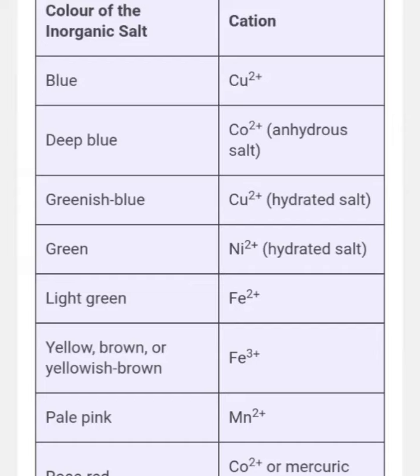All right, these are some inorganic salts that you should take note of their colors. They're sometimes very important in practical chemistry when you are doing your confirmation. These are the preliminary analysis you have to do to identify the color of different salts and precipitates.